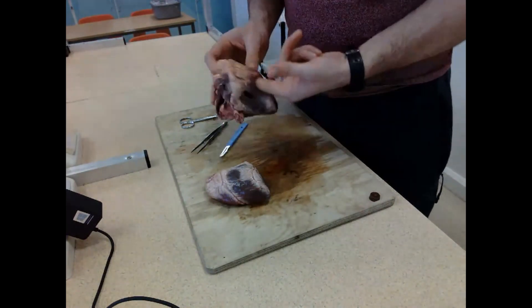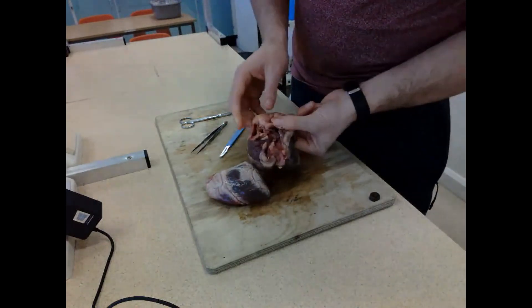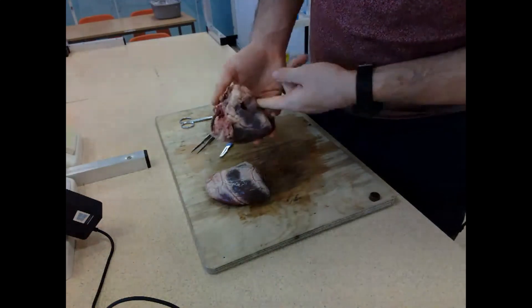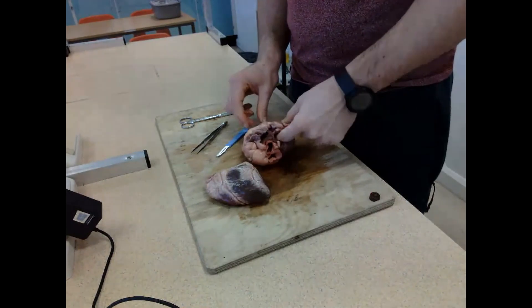Now I'm in the ventricle, which will be proved because I'm going to come up and out through the pulmonary artery - that wouldn't be possible through the atrium. So I'm happy I've identified my internal structures on the right side.